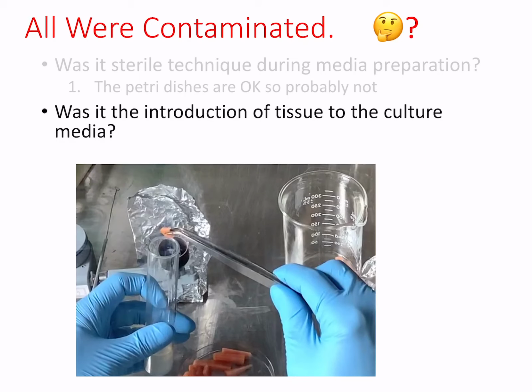The next step was where tissue was introduced into the culture media, and this could have been the point where contamination was introduced. But once again, this was all done at the same time. Since the Petri dishes are okay, it probably was not when the tissue was introduced to the media.